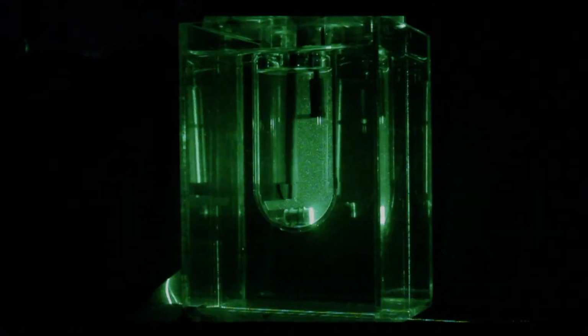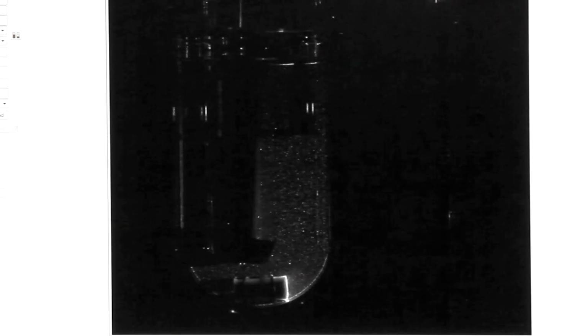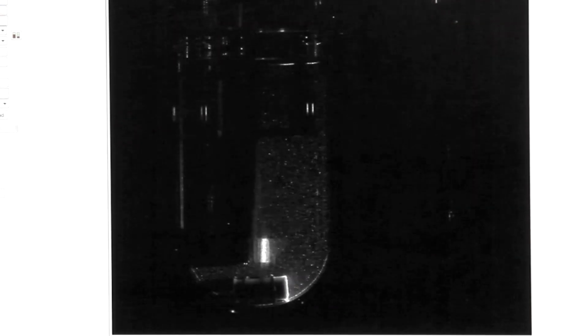And this allows us to calculate local velocities, but also other things like local shear rates, vorticities, sort of local turbulent effects. Now, this technique's really useful in that it allows us to see within vessels themselves and see how things actually behave. This is really useful when trying to optimize processes.